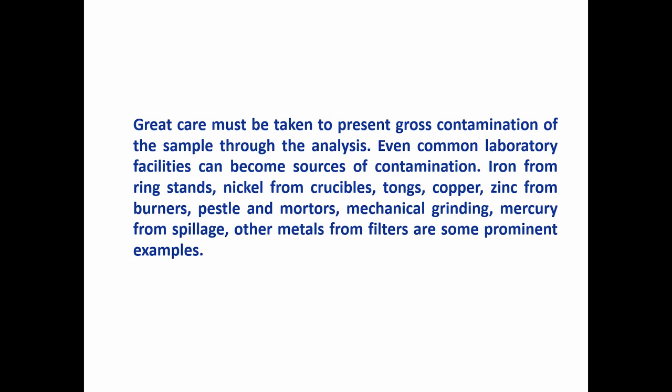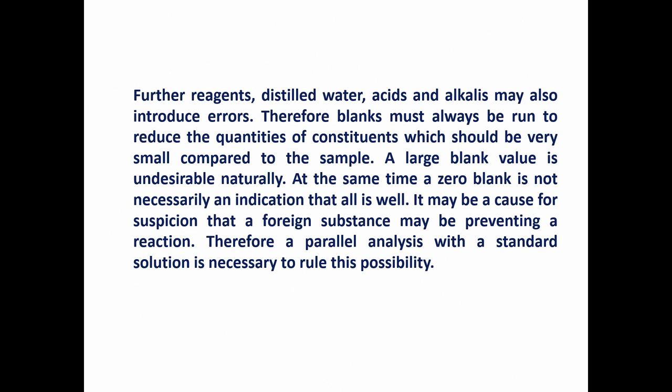Whatever I have told so far, I am presenting in this slide, and when we proceed further, you will be surprised to note that reagents, distilled water, acids and alkalis may also introduce error.